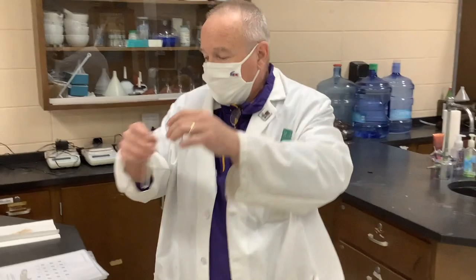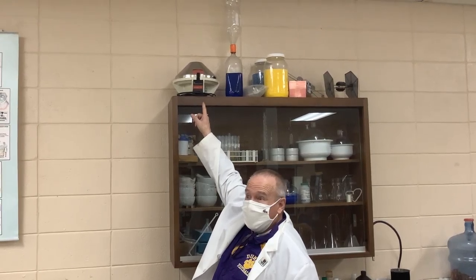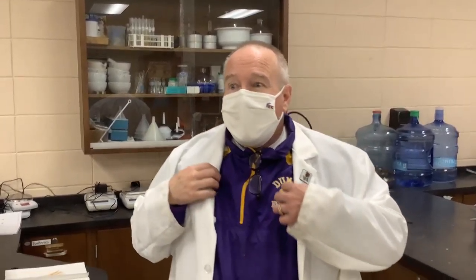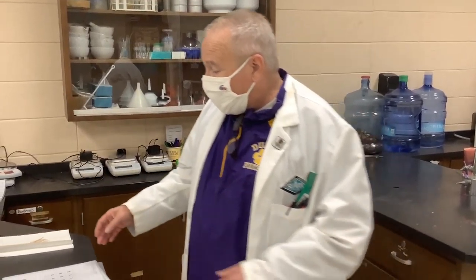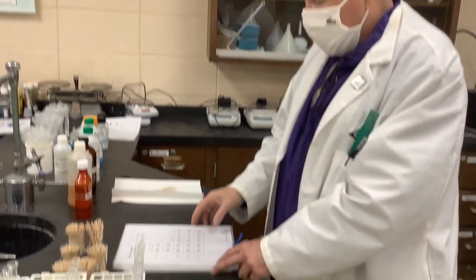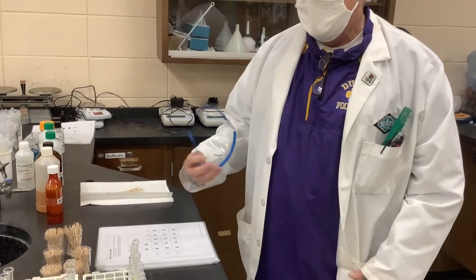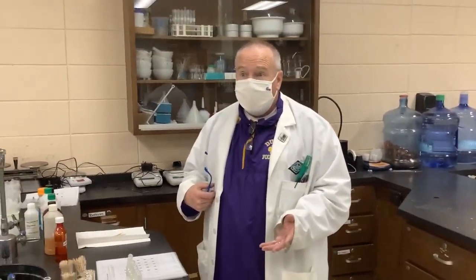I'm putting on my safety glasses. Unlike the old days where we would take compounds, mix them in test tubes, spin them in a centrifuge like that spinet centrifuge up there, and collect a precipitate — we don't waste a lot of equipment and chemicals anymore to demonstrate the same principles. Now we do something called micro-scale chemistry.